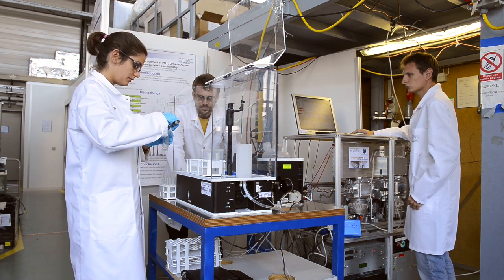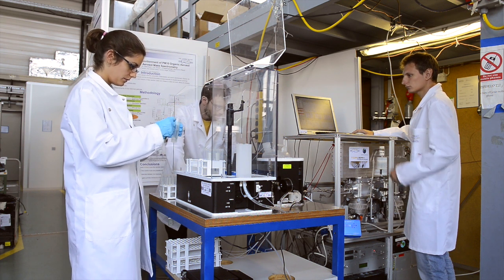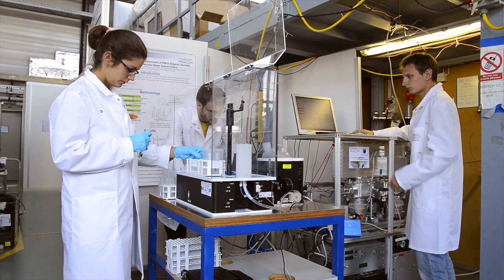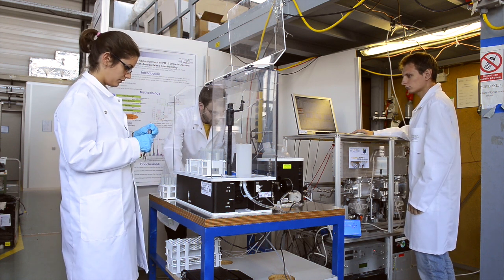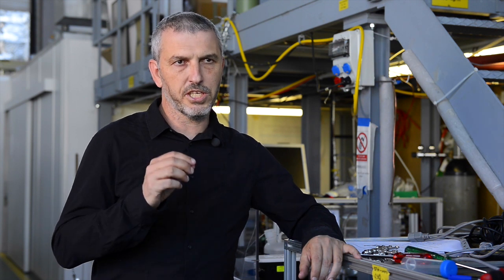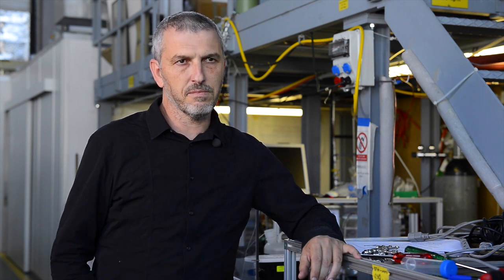Particles in this water are now nebulized in this machine that we have, forming small cloud droplets. We dry them and then form particles again that we analyze with our aerosol mass spectrometry.